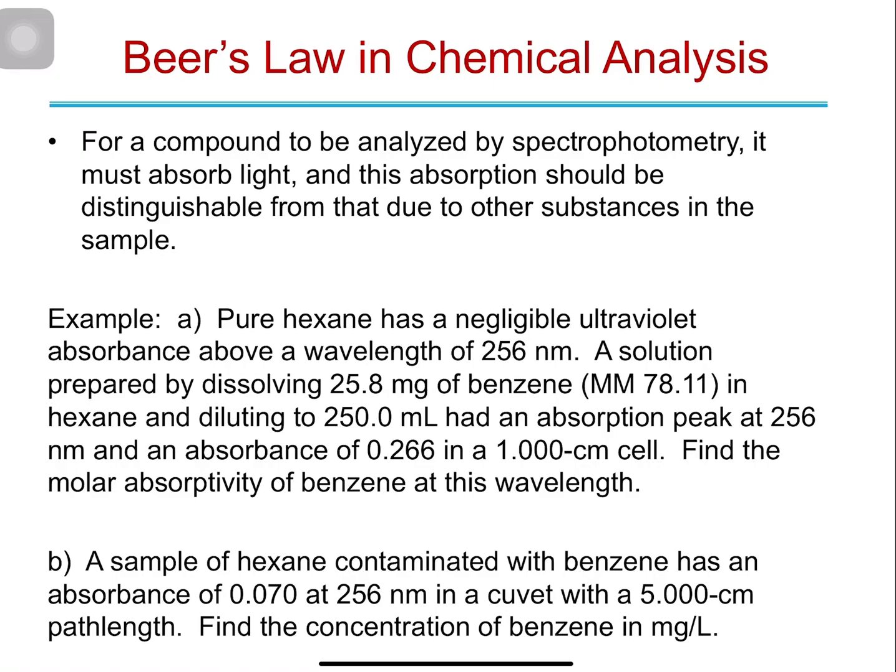This is the first thing, and the wavelengths of absorbance of light must be only due to the colored complex we made or the compound we are measuring its absorbance. And there should be no interference with any substance in our analytical solution. So any interference must be masked first.